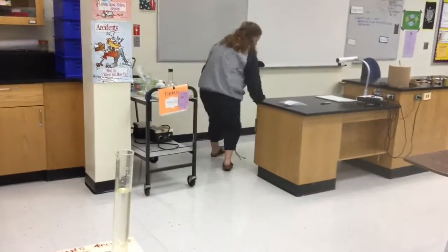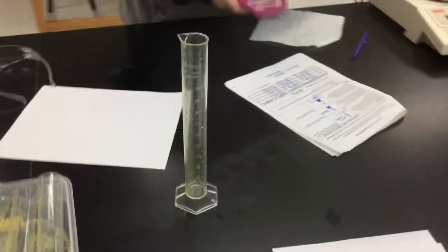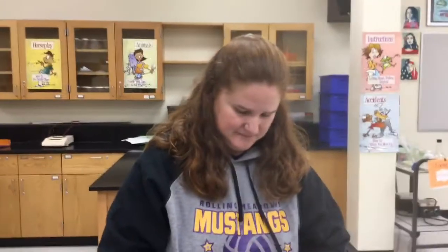Now, while Miss Thorburn's doing the calculations, I'm going to be a nice lab partner. I'm going to take this graduated cylinder and pour it back out into the beaker. And then when I turn off the camera, I'm going to dry this out completely so that the next class has a dry graduated cylinder, because it needs to be dry to get the initial mass of my graduated cylinder.